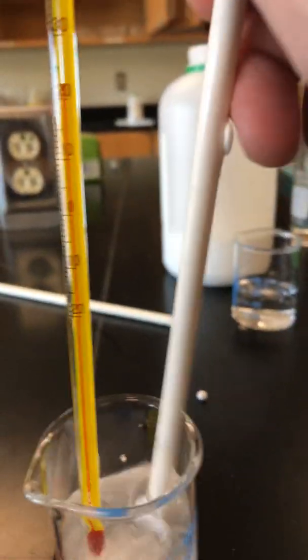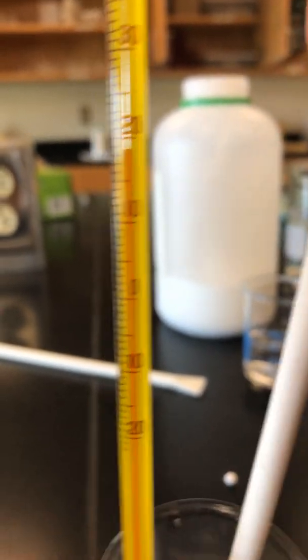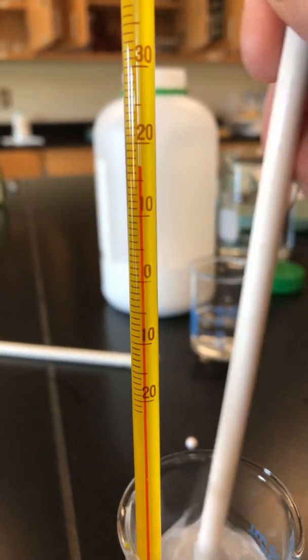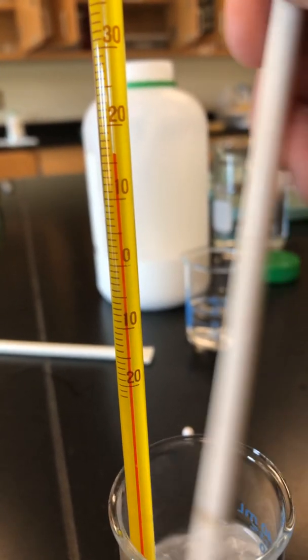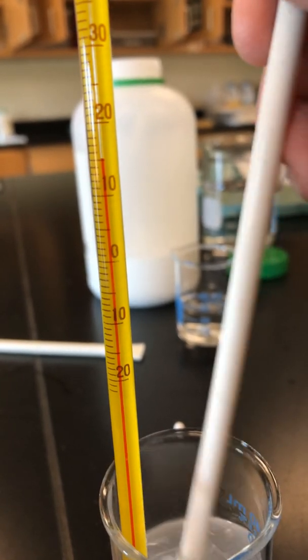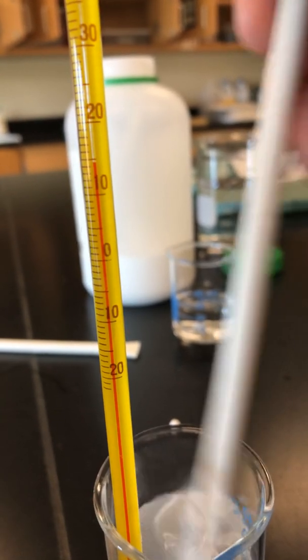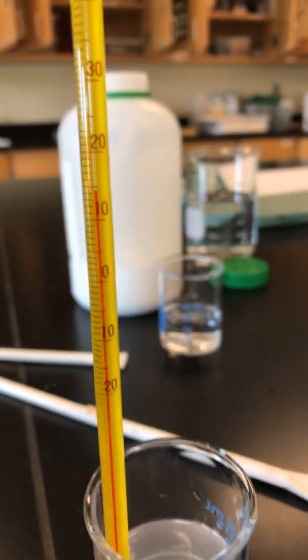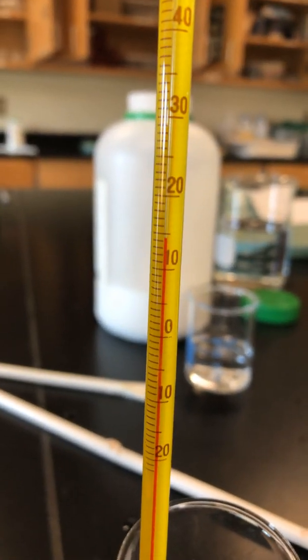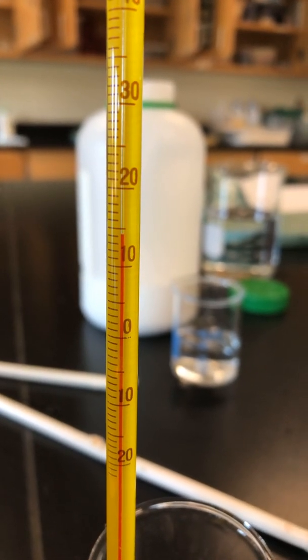And as I am stirring this around, pay attention to what's happening to the temperature. Is it increasing or decreasing? And when the temperature stops changing, you're going to record the solution or mixture's final temperature. So go ahead, record final temperature.